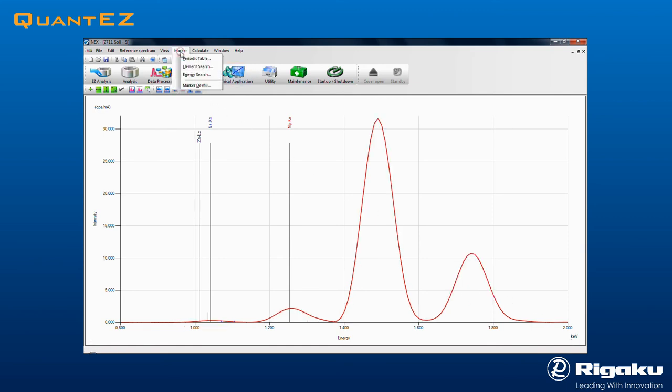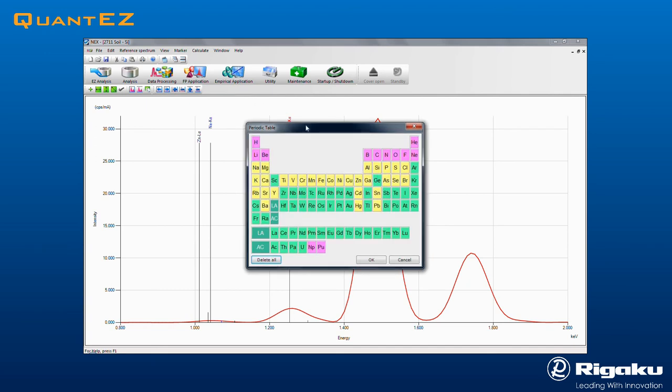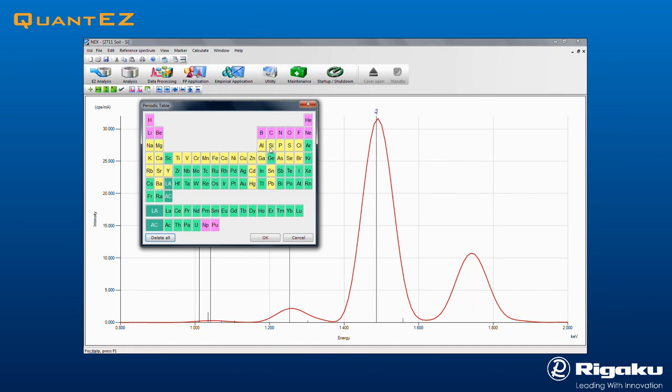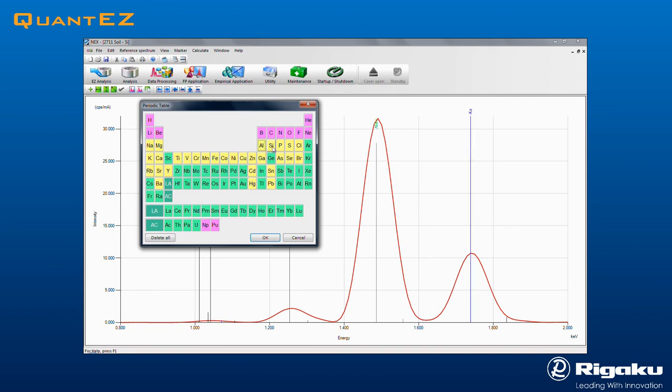Click Marker from the top menu and select Periodic Table from the drop-down menu to bring up the KLM Marker dialog box. Hovering over an element temporarily displays that element's line markers. Clicking on an element toggles the marker on or off.